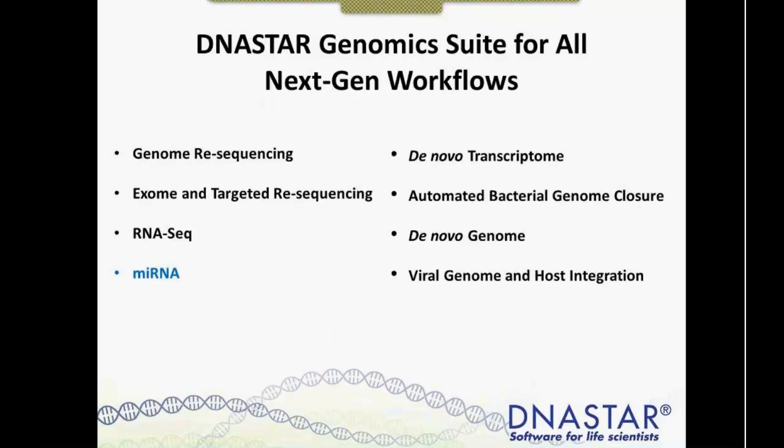So the different workflows that the genomics suite can accommodate are wide-ranging. So again, DNASTAR software has been designed to be as flexible as possible and accommodating to all different types of workflows. And that's really highlighted in microRNA analysis because, depending on what your needs are, you may need different components of almost all of these workflows to do a full analysis of your microRNA.